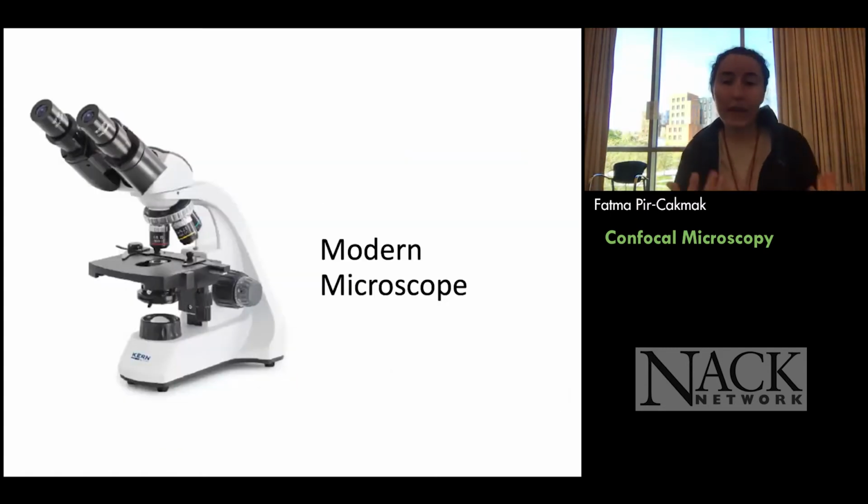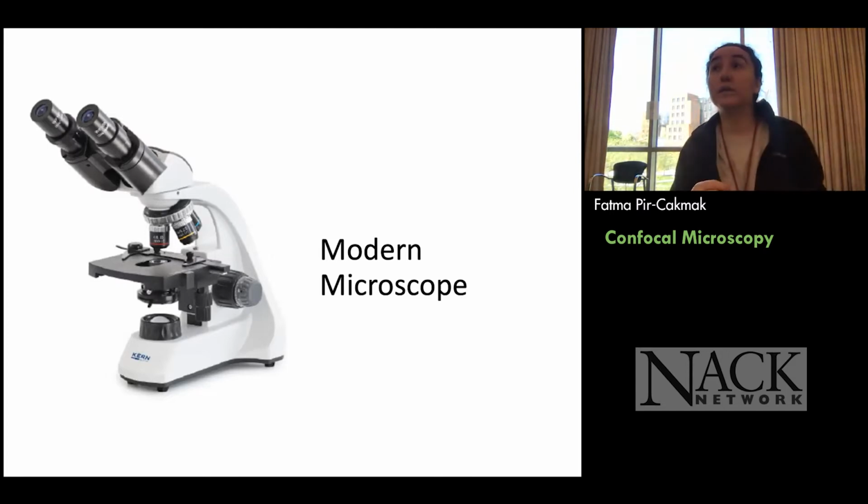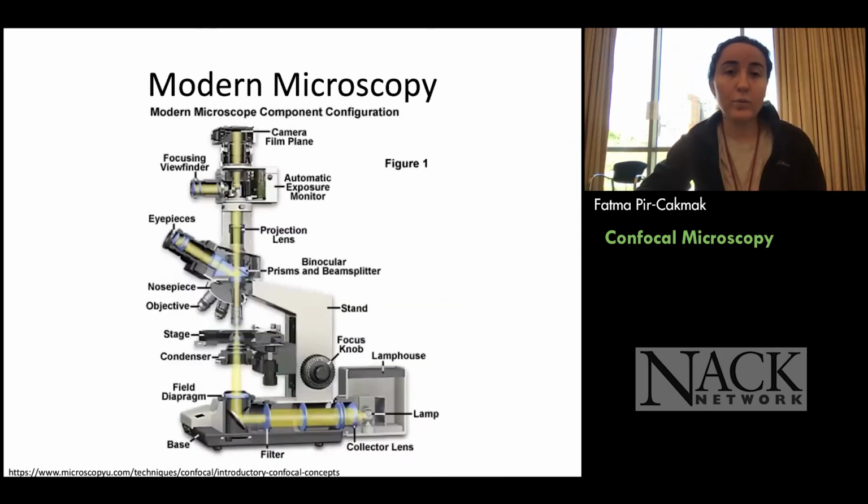So we came to the modern microscopes, right? We start from a very simple thing. The engineers and physicists just built all those things together, and then we came up with the modern microscope.